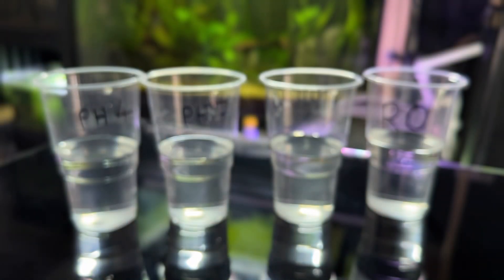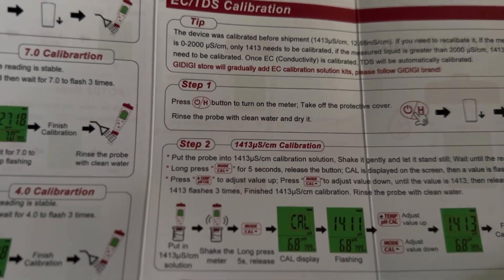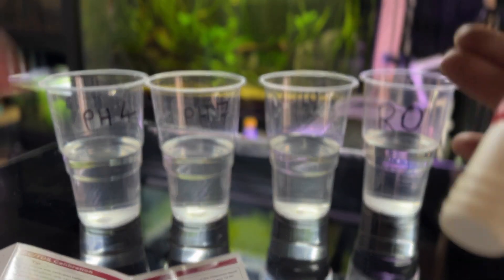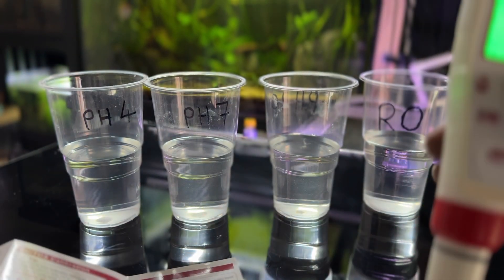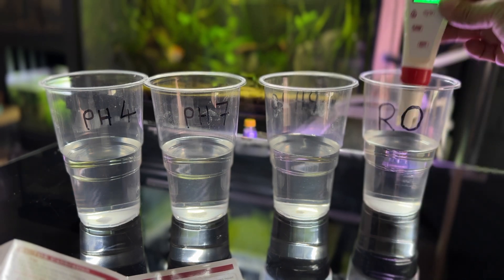You can test the TDS, but you need some 1413 calibration solution — we haven't got that. But we do know what we have for the TDS reading, so we'll switch it on, do a background check, and try the TDS in here.